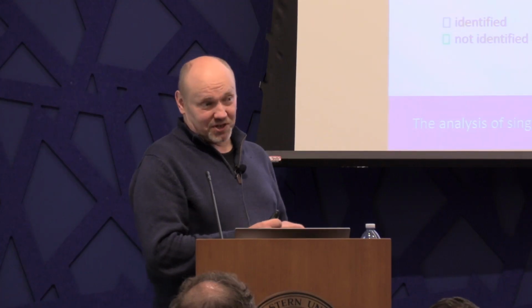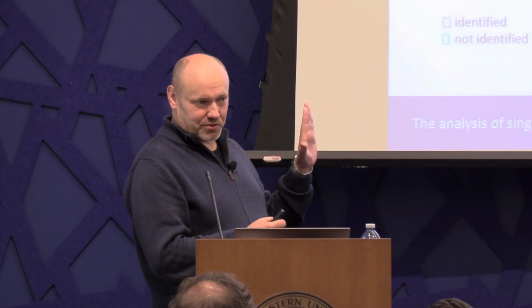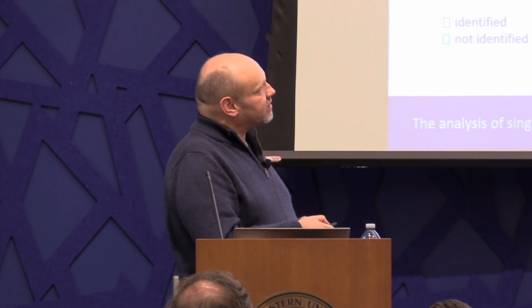At the moment, no. So at the moment, we say, okay, the mass recalibration is so good and the accuracy is so good, and retention time alignment is so efficient and good, that at the moment we don't look or try to rescore the remaining fragments here. But of course, we could just build that in as an option exactly as you do it, basically. I mean, it would actually be very interesting to have that in the same platform and just compare it side by side. So that would be very interesting.